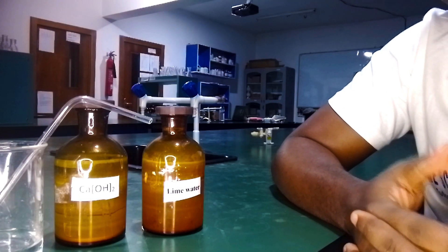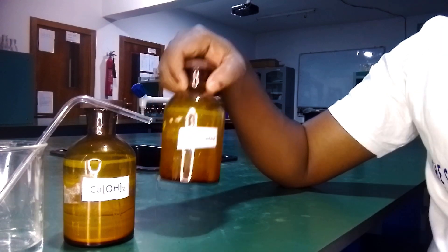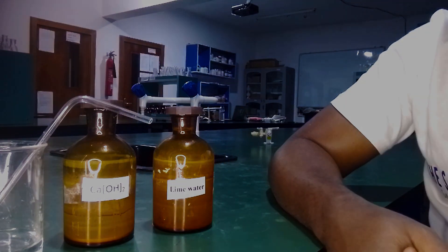Hi, this is the Science Chef. In this video, I'm showing you how to carry out a simple test for carbon dioxide gas using lime water. Let's start.